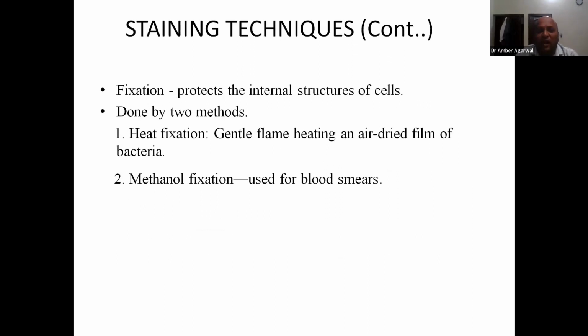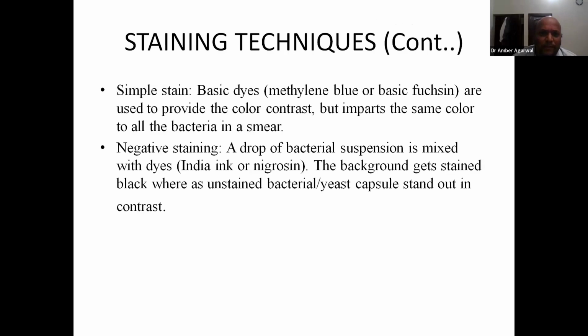Now, fixation can be done by two methods. It is either heat fixation or methanol fixation. Mostly in microbiology labs, we do not use methanol fixation, we use heat fixation only. And the most common techniques we usually do are gram stain, then ZN stain, and then Albert stain is infrequent, but we still do it.